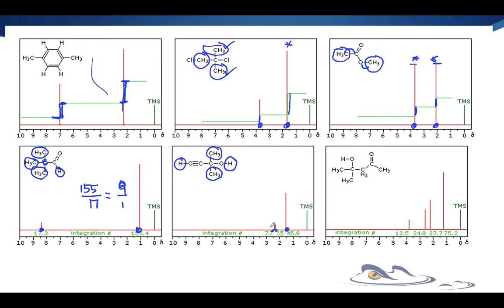Again, I would sit down with these integrated numbers to come up with a ratio, right? So 7.7, 7.5. They're just a shade bit different from each other, but that's pretty close to just 1 to 1, isn't it? And then this is 45, so 7 to 45, so almost 46, huh? So if I say, okay, I got 46 to 7, what would that ratio be then? 46 to 7, 46 to 8 or so.